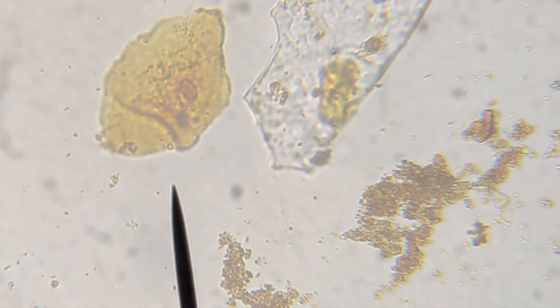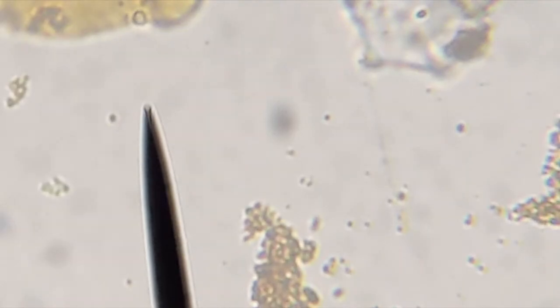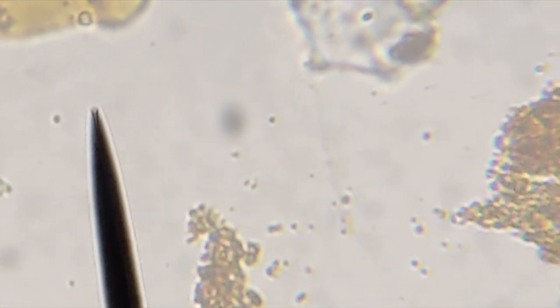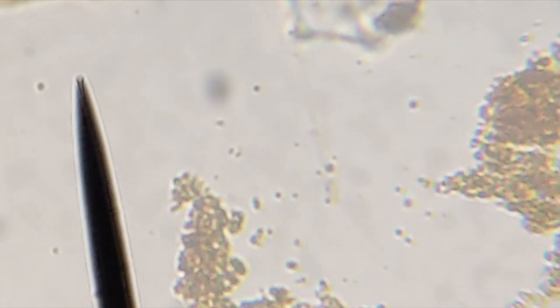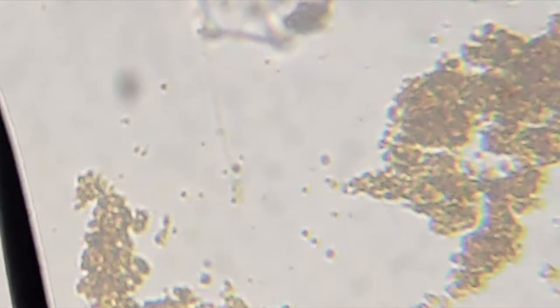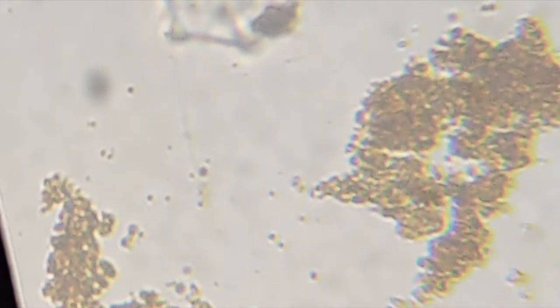You can derive the length of a prokaryotic cell. You can see these little diplococcus bacteria — I imagine they might be Streptococcus thermophilus — wiggling along. You can find those bacteria in the open spaces on the yogurt and do some comparison measurements there. Pretty awesome all around.